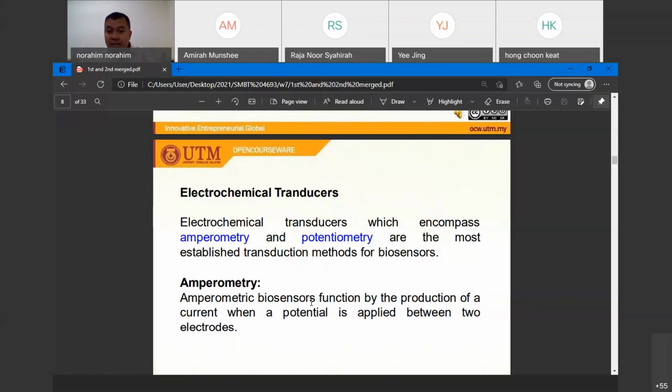So without measurable signals, I mean, now we all talk about digital, right? We can no longer look at needles and such. Now we have to integrate these reactions with electrochemistry so that you can see the signals in numbers. You see on the screen what the pH is, what the current is, then you know the concentration of, let's say, contamination.